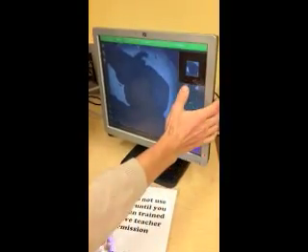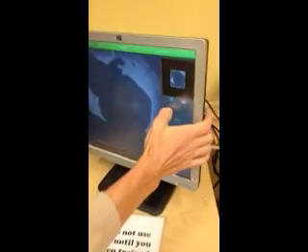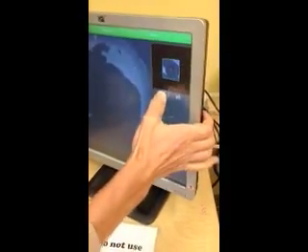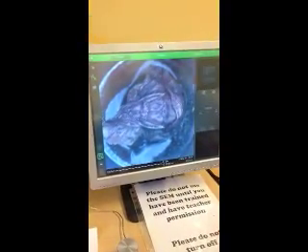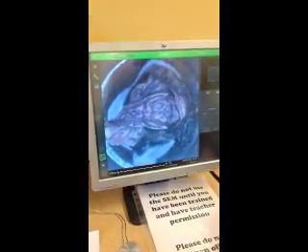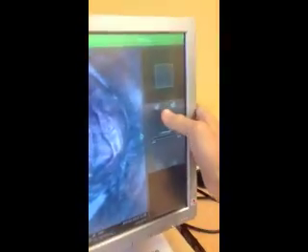Now the vacuum starts. You can then press the scanning button, which is this maze-looking button. When you've inserted your sample, you are ready to map it. So the first thing you do is press this button that looks like a maze, and this will take a few seconds to map the entire sample.